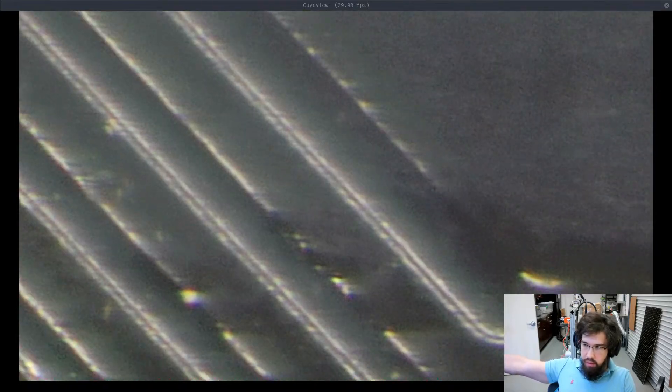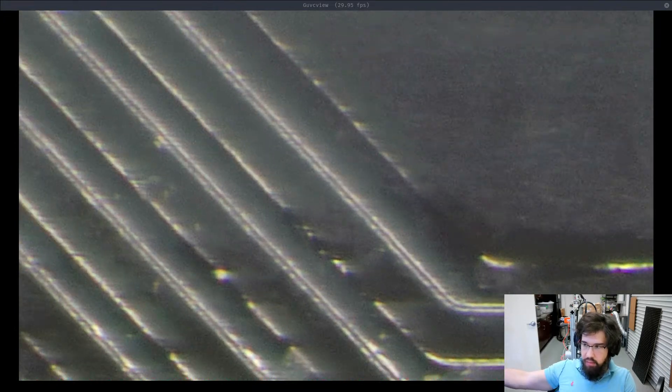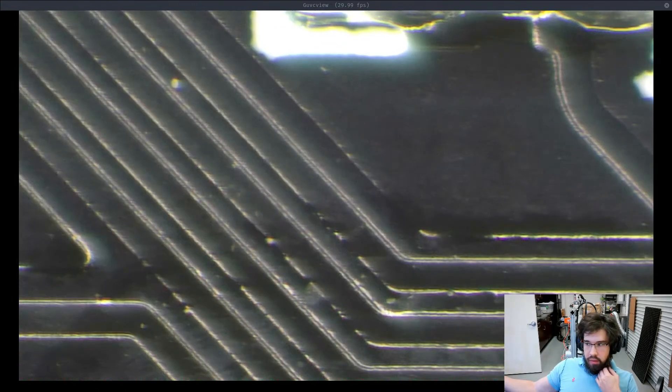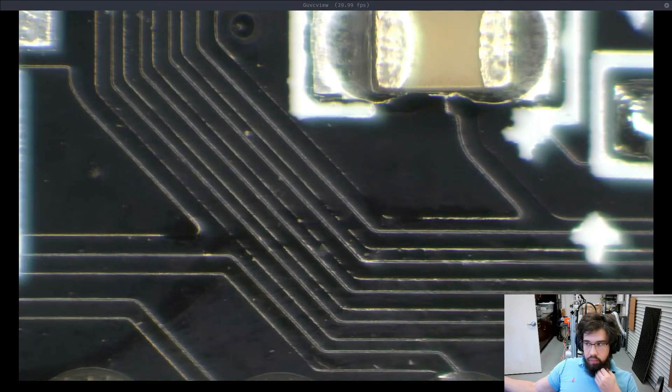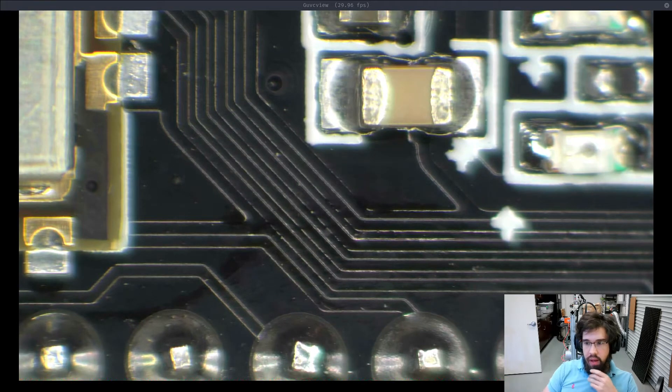You can't just hold it down, you have to press each time you want to change it. Right now I am at the minimum amount of zoom on my microscope, and I'll transition over there.